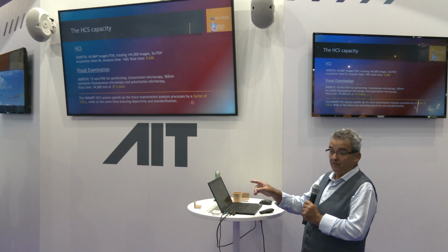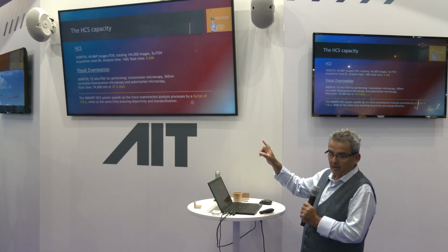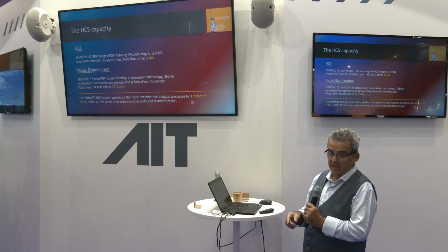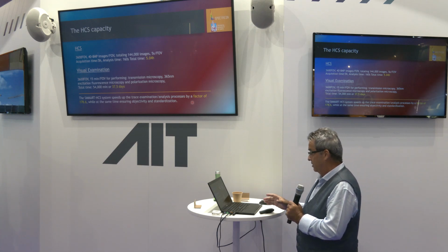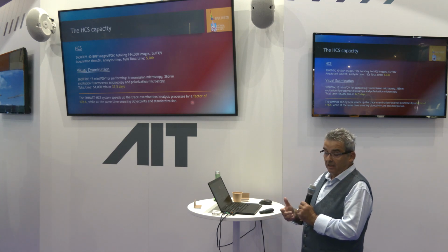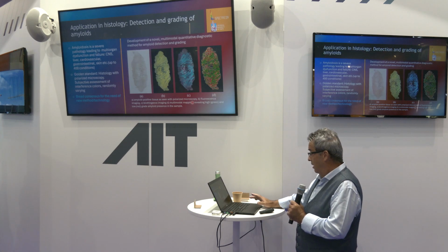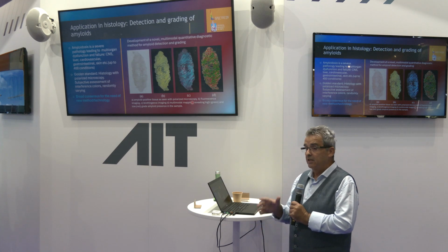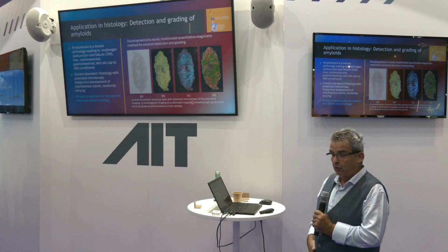If you do this same analysis with just 1/3 of the techniques that the system integrates, it takes 37.5 days. So it's not possible to do this. So we improve the workflow by a factor of 180. So that is for forensics, and this is becoming a standard now in forensics labs across Europe.